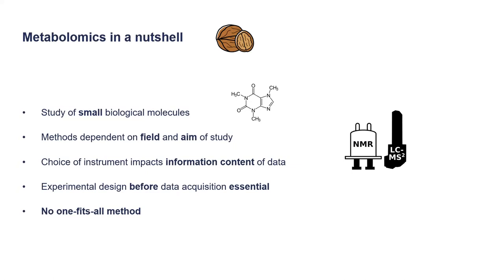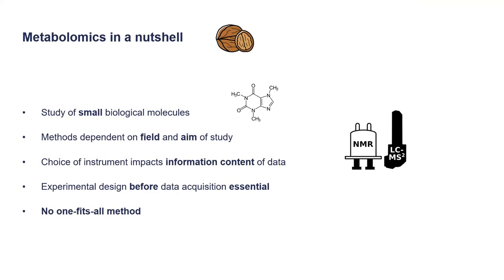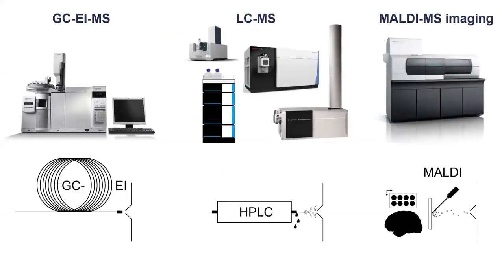If you can't detect it in your system, of course it doesn't make any sense because you will miss it, and then you will be like, oh, it's not there, but maybe it's just because of the instrument and the settings. And that's why it's always important. There's no method that fits everything, so you always need to check what's actually my question, my research topic, and does this method actually fit what someone else maybe did in another paper, for example.